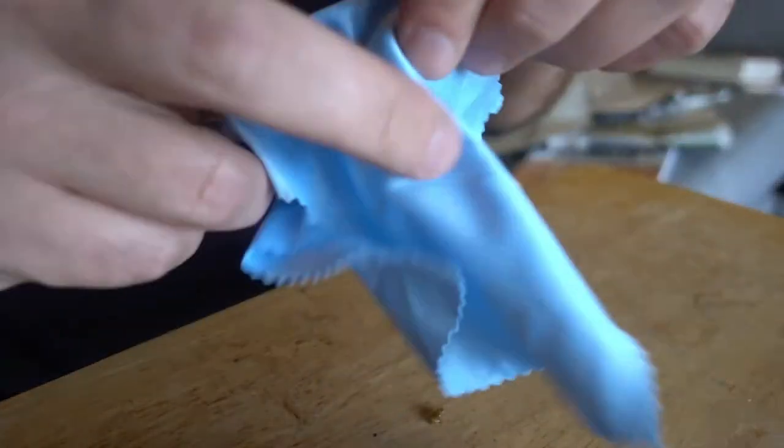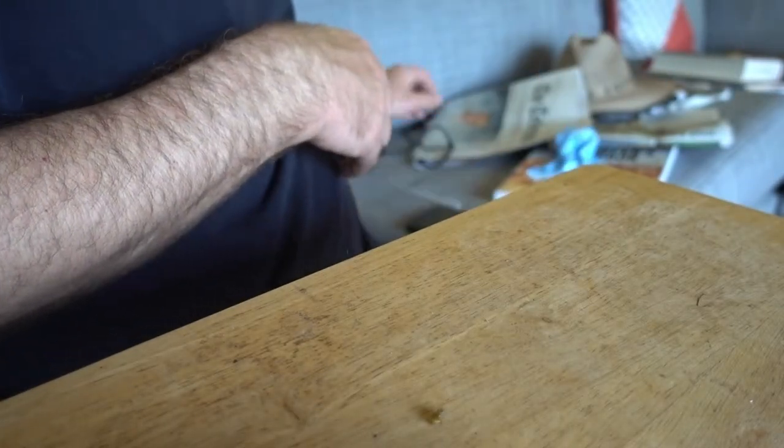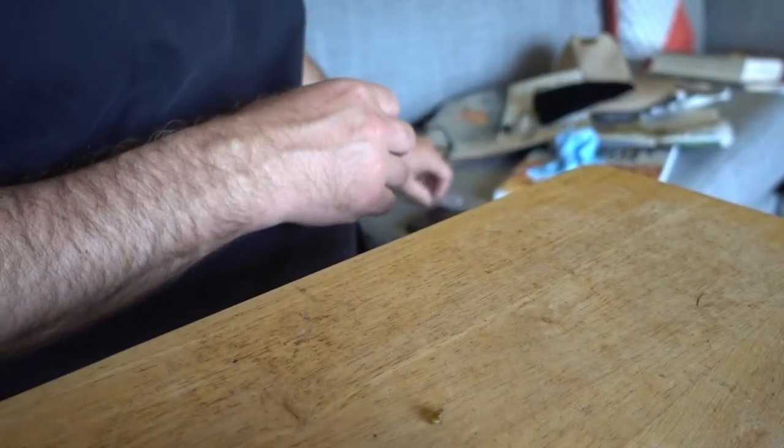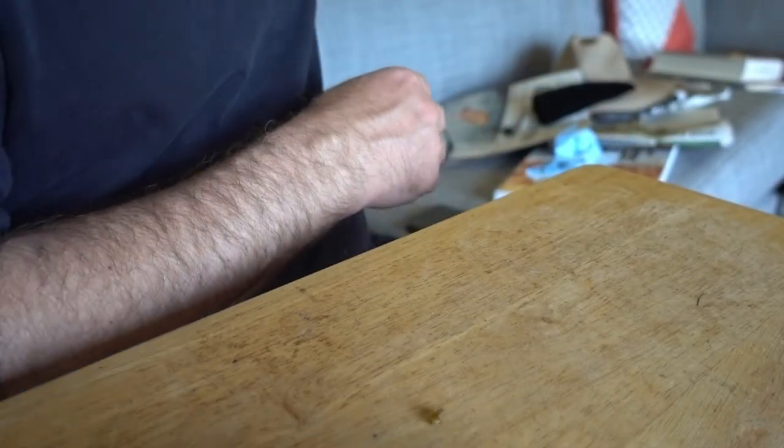It's got a little chamois for cleaning the thing and it came with a little velvet bag just because everything has to come in a little velvet bag these days.